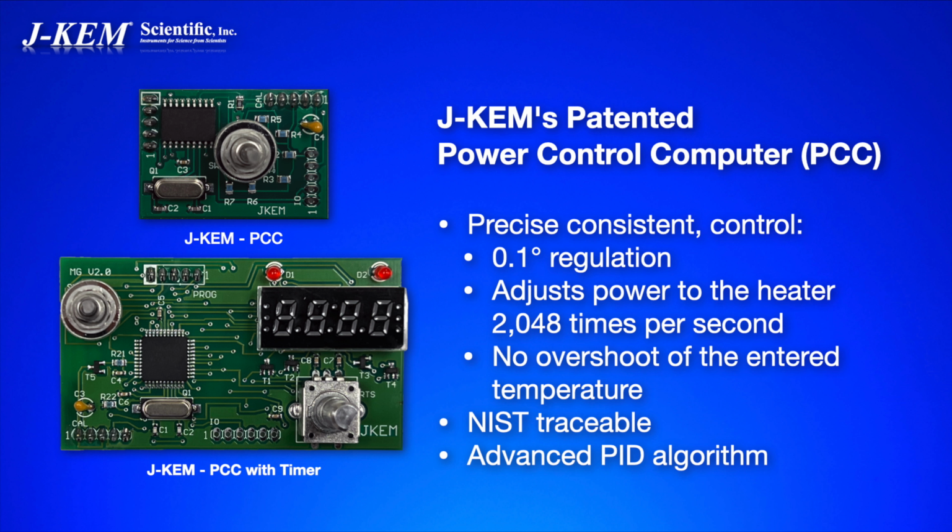computer. You can look at our controller and you can look at another controller from a different manufacturer, and they look similar. They're both going to have a digital meter. They're both going to have a power cord. They're both going to have a place to plug your heater into. The difference is, in our controller, we have the same PID meter, but we also have a power control computer.